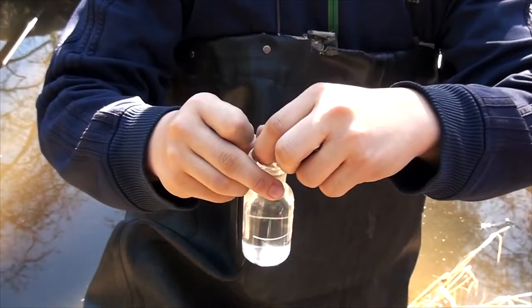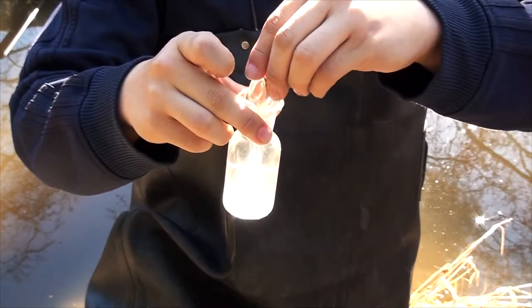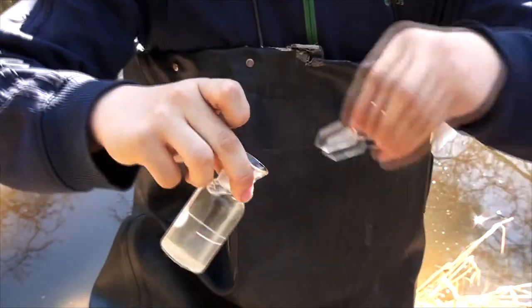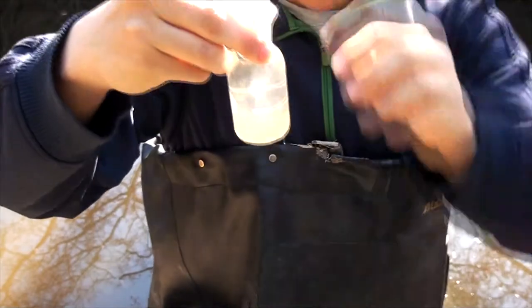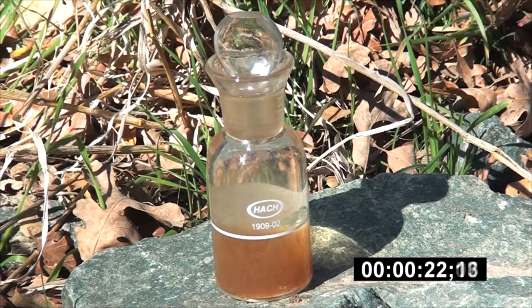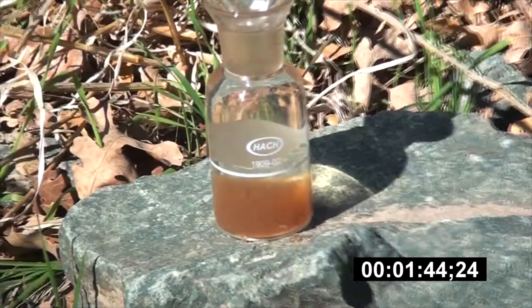Remove the stopper and add the contents of one dissolved oxygen 1 reagent and one dissolved oxygen powder pillow. Replace the stopper in the bottle carefully to avoid trapping air bubbles. If there are air bubbles, discard the sample and start over. Shake the bottle vigorously to mix the reagents until flocculent, or flock, starts to form. Wait for the flock to settle below the halfway mark of the bottle. Then continue to shake vigorously and wait again for the flock to settle below the halfway mark.